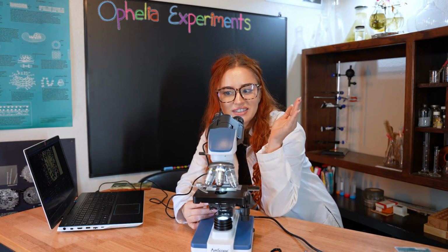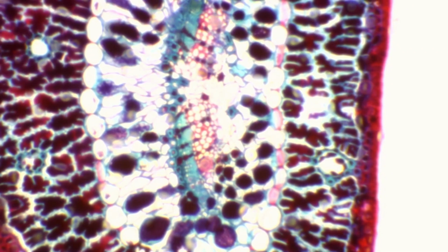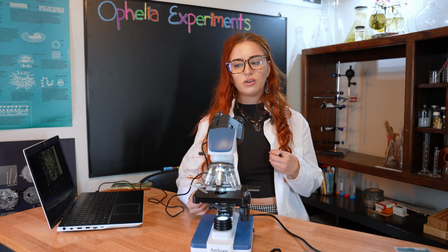Lastly, we're going to take a look at the resin ducts. The resin ducts are internal ducts that basically look like elongated tubes. These ducts carry resin, which is a sticky substance that helps the plant heal from injuries. Isn't that cool? One of the ways that pine needles help the environment is they filter out a lot of toxins and pollutants in the environment.